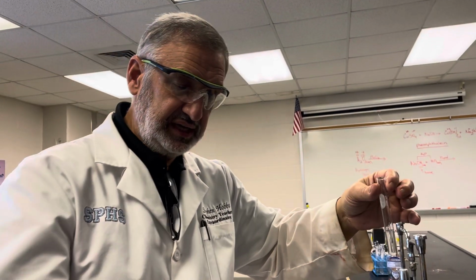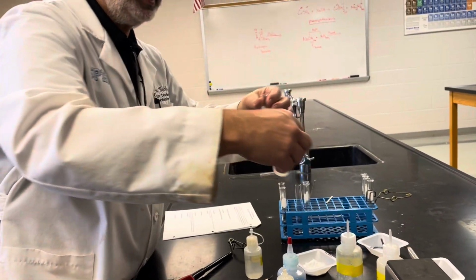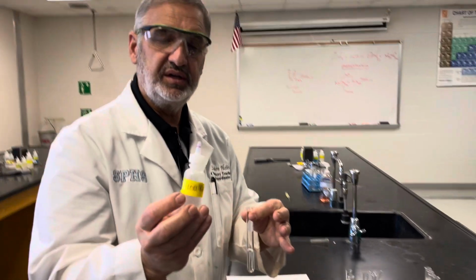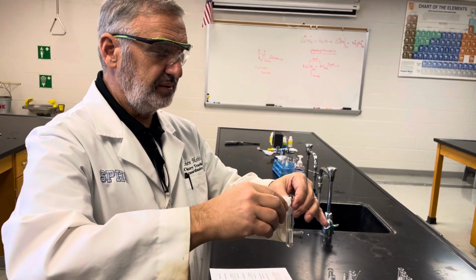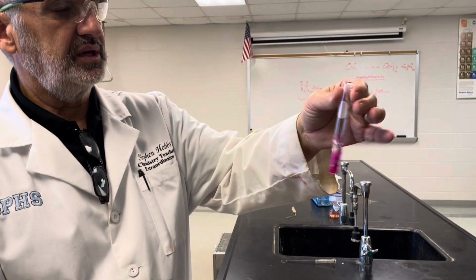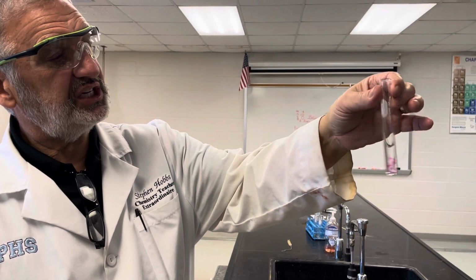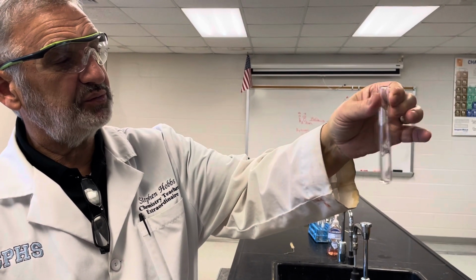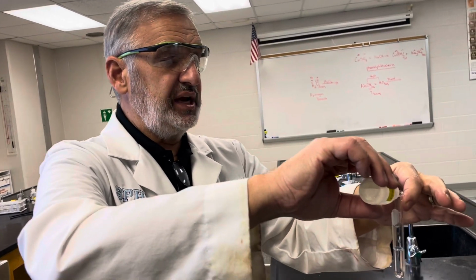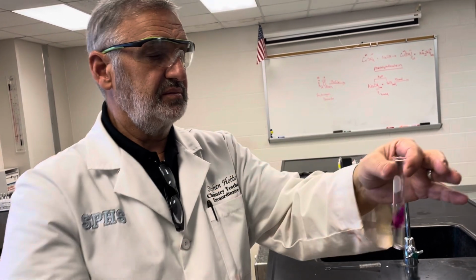Now I'm going to take some NaOH. It's the same strength, so I'm going to pour a whole bunch in. Okay? Now the H pluses from the acid are seeking out the OH minuses from the base, and where there's a bunch of OH minus, it turns that magenta color. But now there's more H pluses than there are OH minuses, so I'm going to add a little bit more.